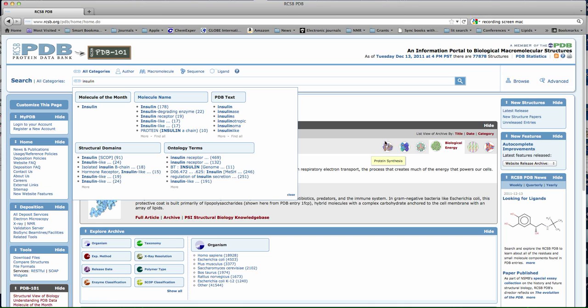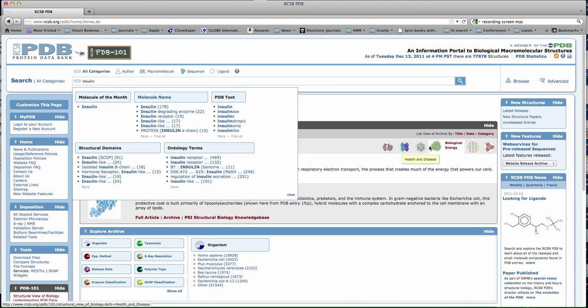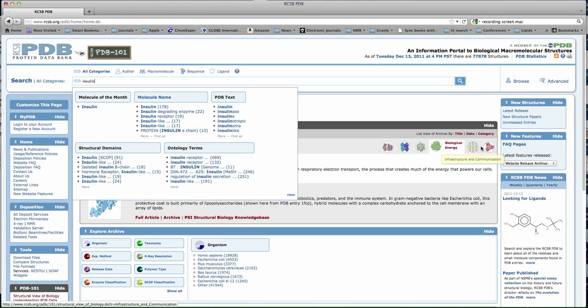We've got things involved in protein synthesis, enzymes, health and disease, bioenergy, infrastructure and communication, and biotech and nanotech. Let's take a look at an enzyme.